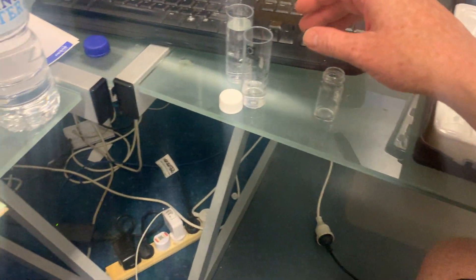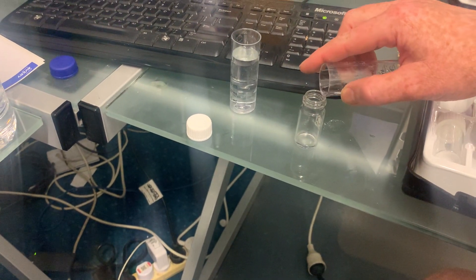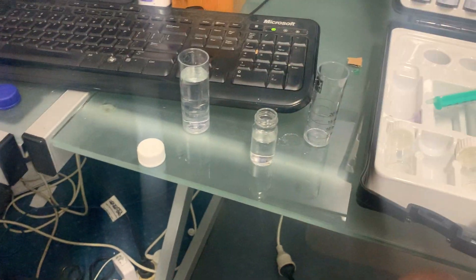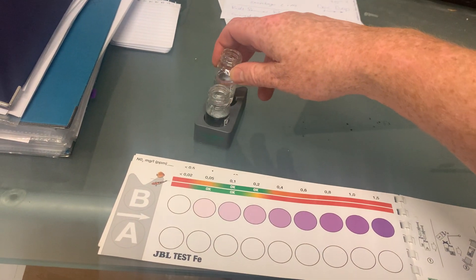First of all, I need to put 10 mils of water into here. I'll get 10 mils and put in 10 mils of water that I want to test, then place it in the comparator. That's just some water from the tank.